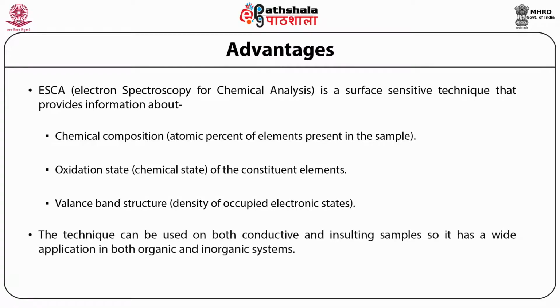The technique can be used on both conductive and insulating samples, as it has a wide application in both organic and inorganic systems. So this technique is useful for organic systems as well as inorganic systems, which one rarely finds.